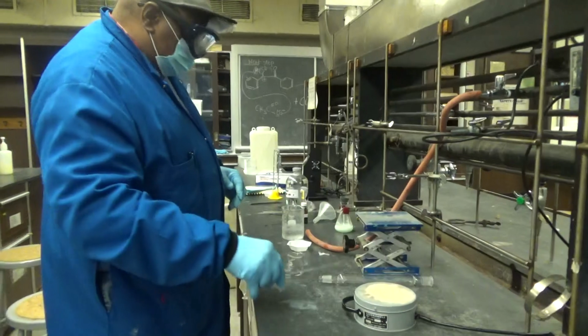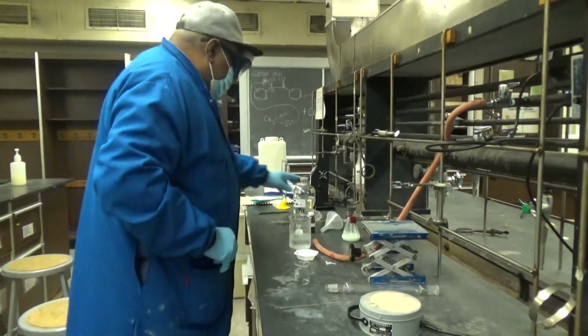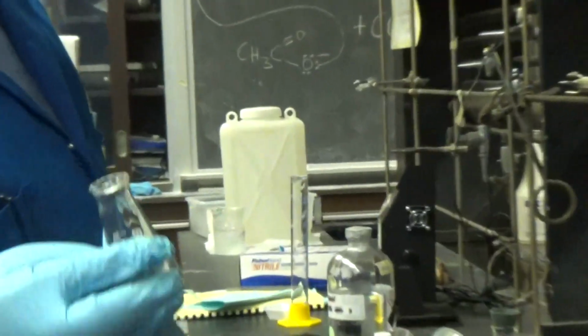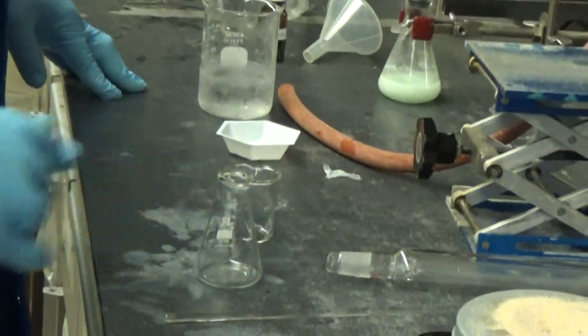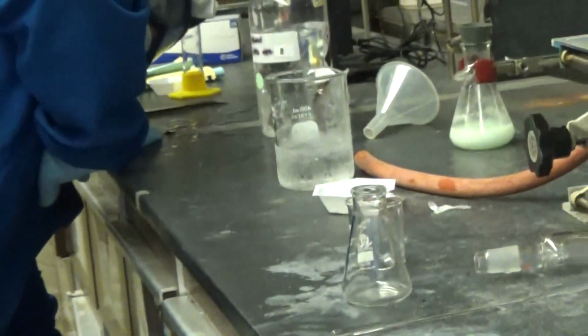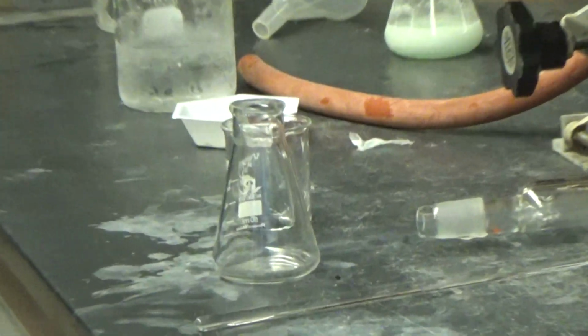You need a glass rod. And we need a 50-milliliter Erlenmeyer flask. That's where you're going to do the crystallization. So we need first the plastic funnel.